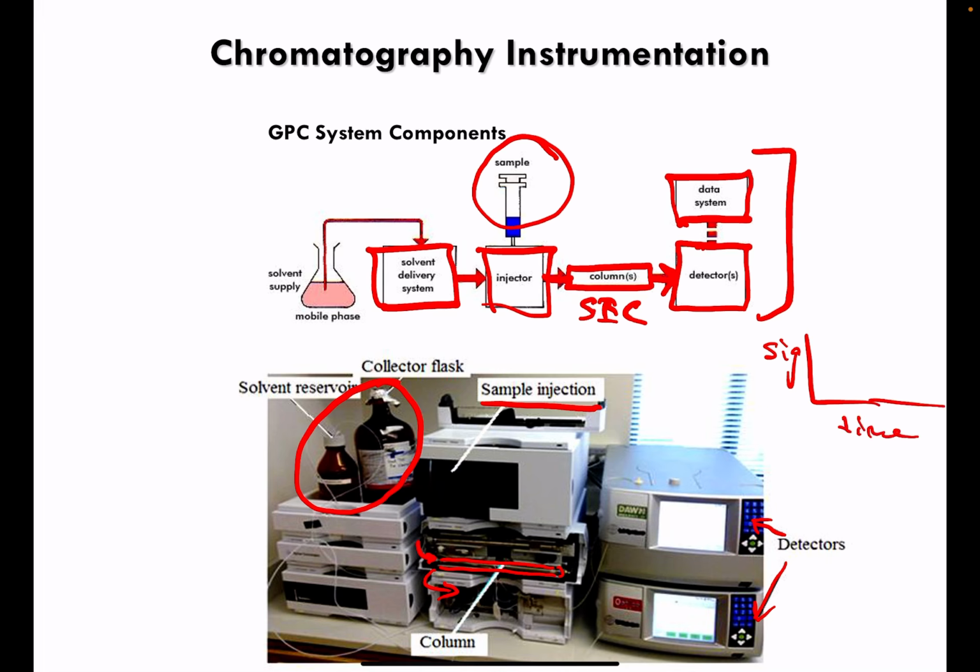as we mentioned. At this point, you might expect here that the flow rate of solvent can also allow for the x-axis to be plotted as volume of eluent to elute the material. So time and volume are synonymous by flow rate.